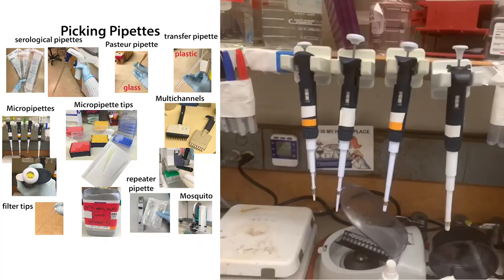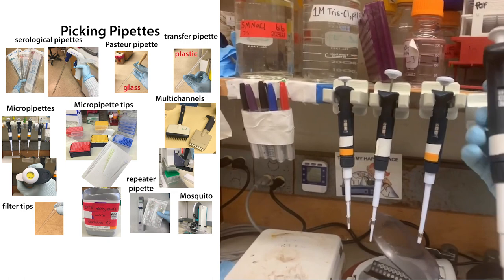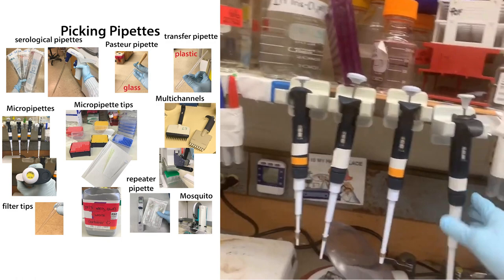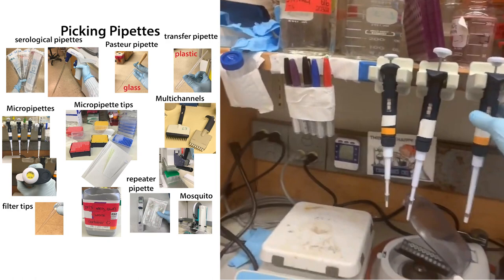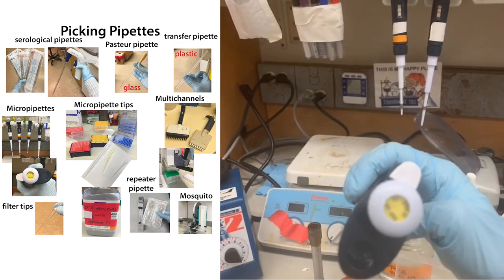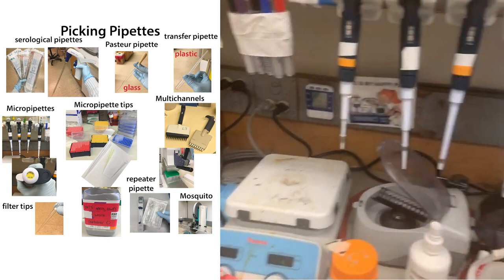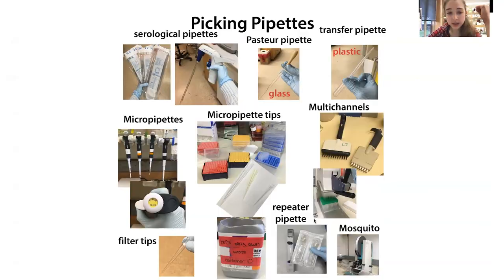Of course, one of the most important things are pipettes. In a biochemistry or molecular biology lab, you're usually talking about these micropipette headers. They come in different sizes with different amounts of liquid and different tip sizes — you suck up liquid and push it out. We tend to refer to them by their sizes: this one goes from 20 to 200 microliters, we call it a P200. This one goes to 20, we call it a P20. This one goes to 10, we call it a P10, and this one goes to a thousand — the P1000. A thousand microliters is one milliliter.